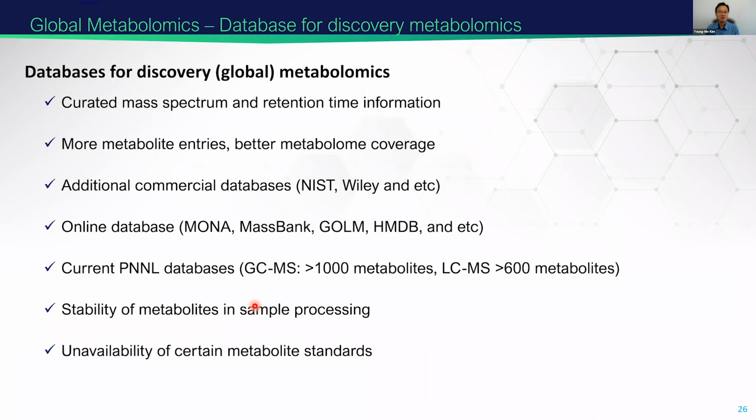In-house, for LCMS or GCMS, especially GCMS, the data are more reproducible lab to lab or machine to machine. However, for LCMS there are a lot of variations in column length, flow rate, solvent composition, and pH. So the LCMS side is a little bit hard to generalize into one protocol. That's why an in-house database or library is needed to generate accurate metabolite IDs. That is a key component. There are some software and online databases, a lot of options. Currently at PNNL we have been developing for GCMS and LCMS, and we still keep adding new metabolite information to our library, so we get expanded coverage year by year.